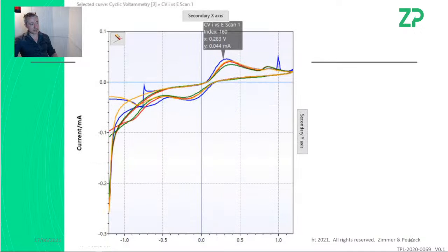This is the CV they've sent us, and it's pretty good. Everything's consistent up here and here, but they want to answer the question why it's dark, or partly why it's dark. First of all, they're going to quite wide, very wide voltages. In biosensing, you generally don't go much below minus 0.5 volts or much above 0.9 volts, and that's the kind of window, let's say. Here they've gone to 1.2 volts and down to minus 1.2 volts.